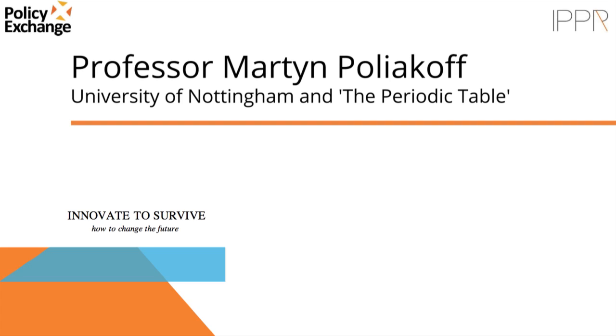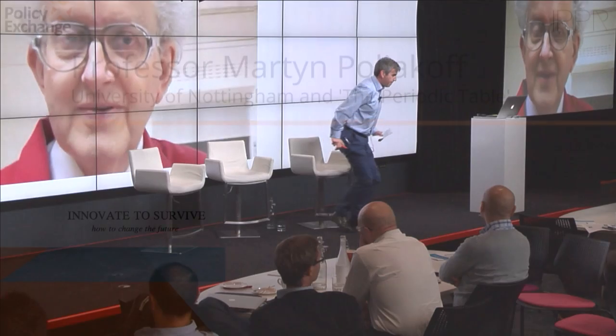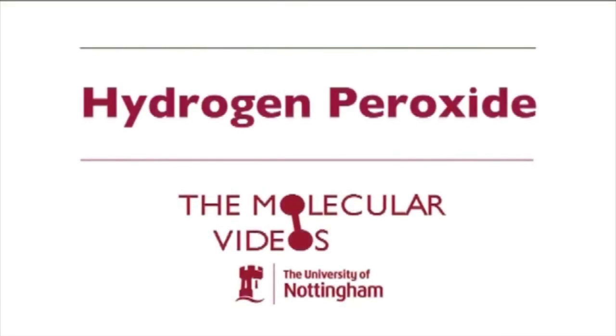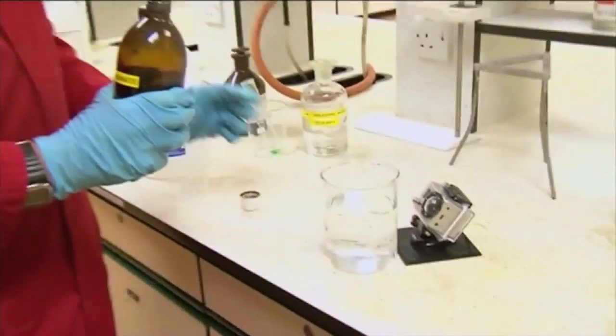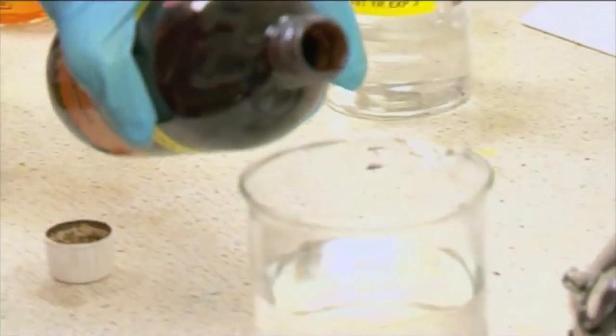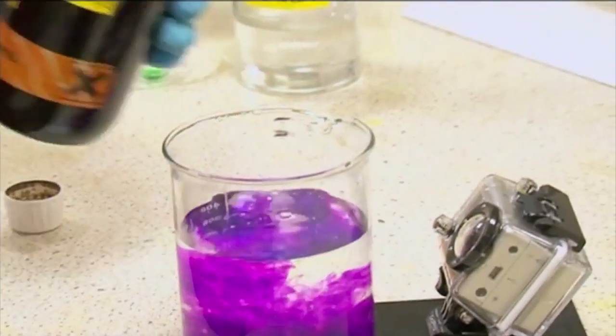I'm now going to do one of my favorite reactions. It's not very spectacular, but I think it's very satisfying. It's the reaction between hydrogen peroxide and potassium permanganate. Let's begin with a bit of water. So I'll add some potassium permanganate, which gives it a nice pinkish purple colour.